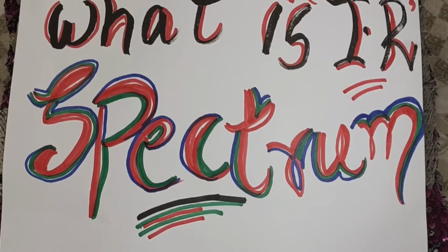And then you go for the third characterization technique, that is the IR, infrared spectroscopic studies. You go for these studies, and then you move forward with other characterization techniques. So let's start. What is an IR spectrum? This is our today's very interesting topic.